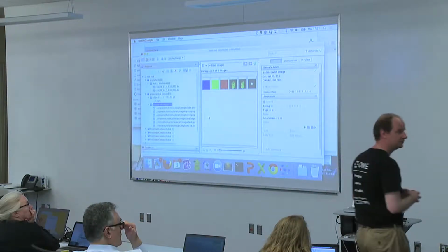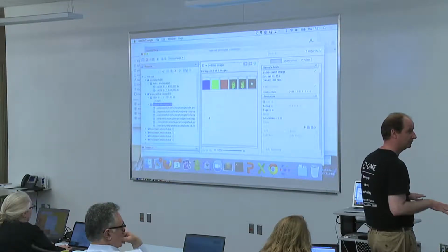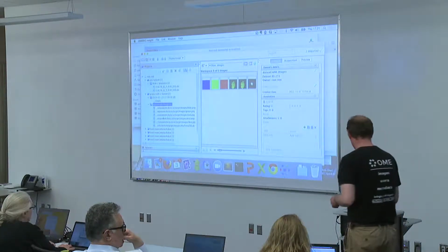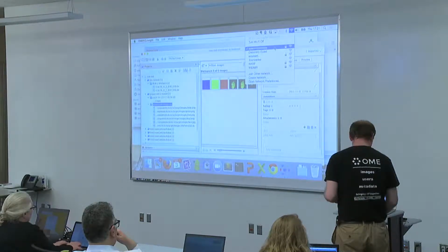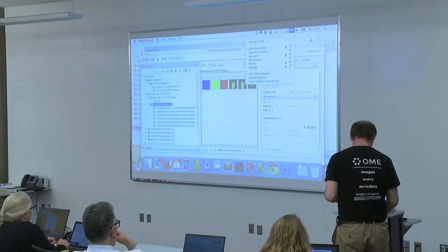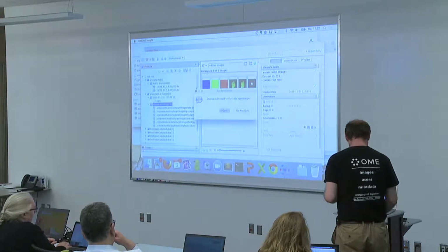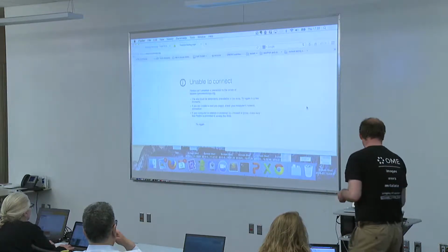Okay, can you do something with the OMERO Web or not? Nothing at all? Okay. So you should be able to connect with the Insight lab tool. Okay, let's do it. Let's just try. I will try with you. Aha. Okay. So I will go with you once more.